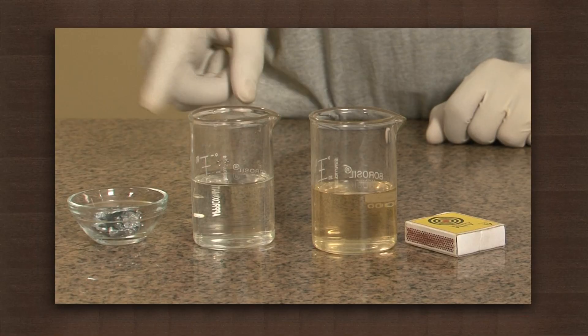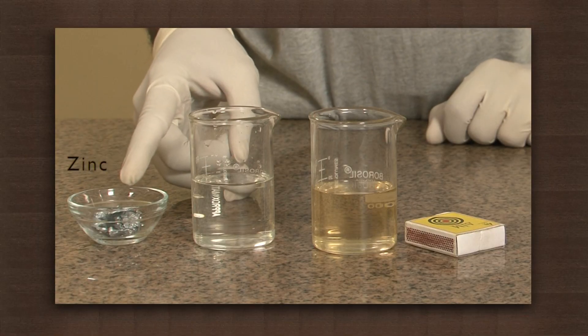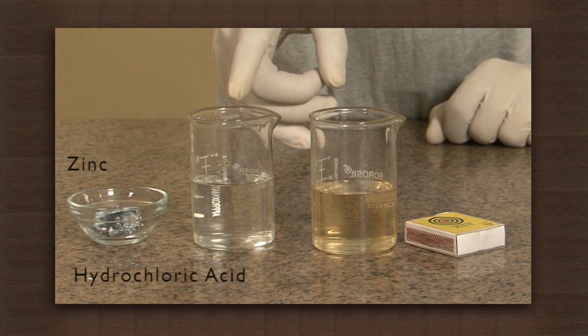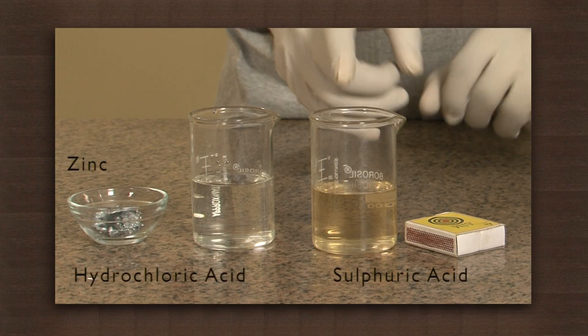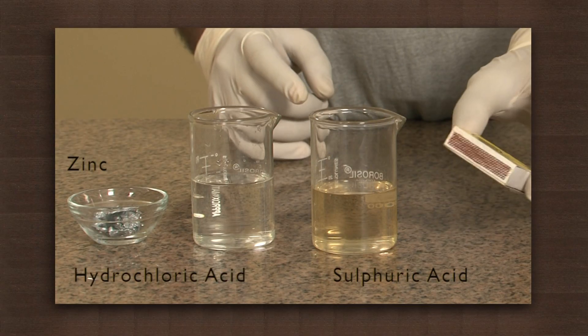Now let us see what kind of reaction occurs if acids come in contact with metals. We need zinc granules, which are metals, dilute hydrochloric acid and dilute sulphuric acid, and a matchbox.